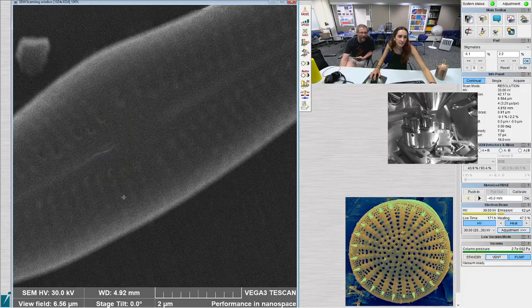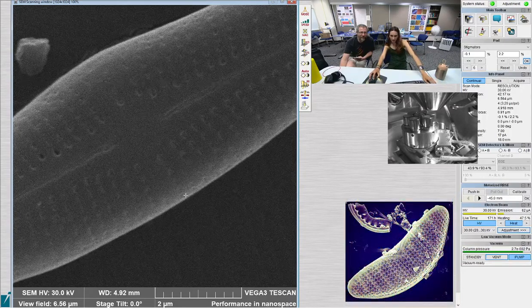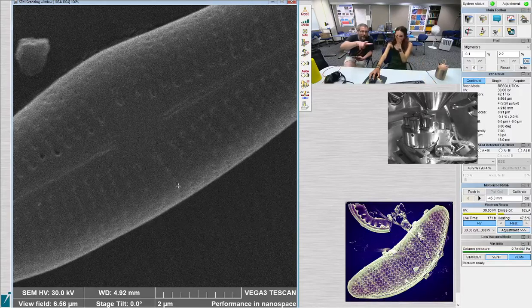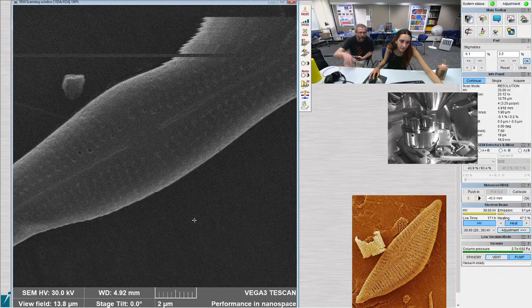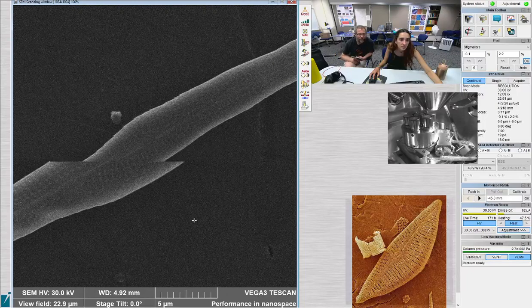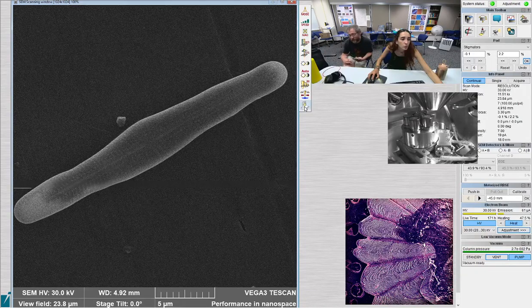Interesting. Ooh. I don't know. Does it have something here? Yeah, it does look like it has striae, shortened striae. The other one didn't have anything. I think it's the same, though. I think that other one just didn't have as many striae in the middle. It had short ones, it just didn't have the long one in between. I think it's the same one. Maybe it's just an initial valve. Not the same specimen, but the same species.